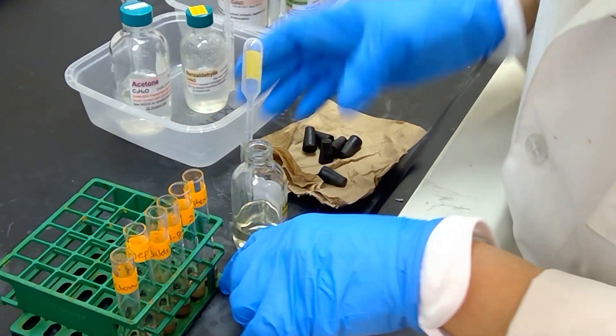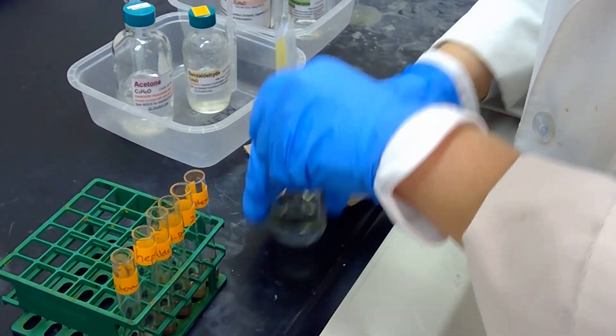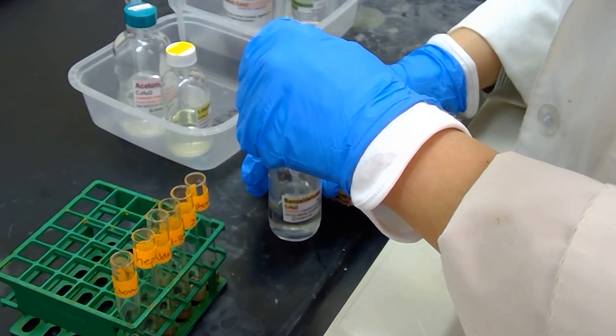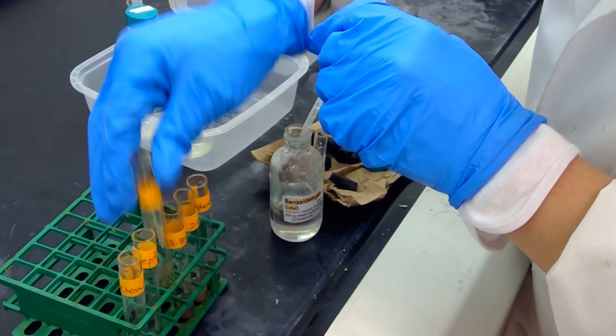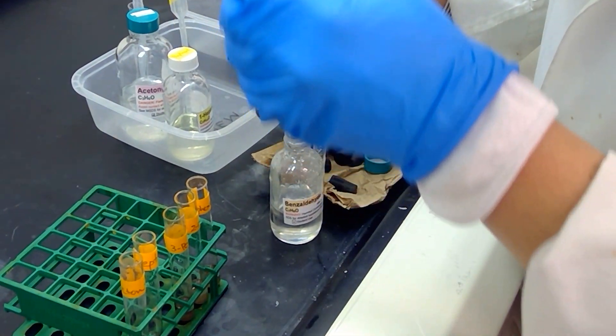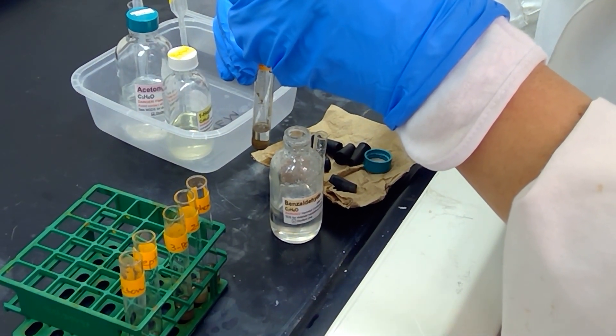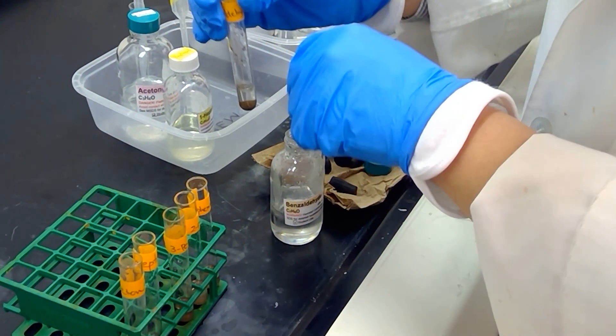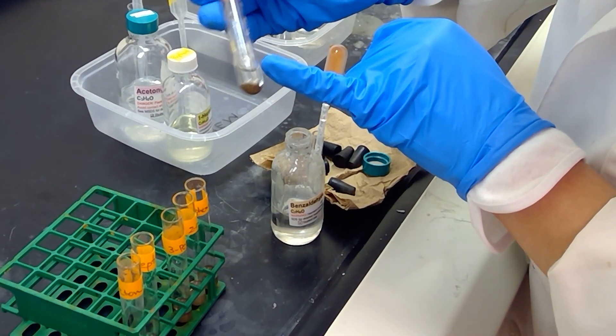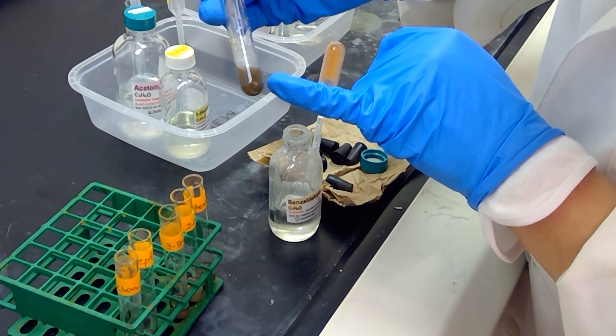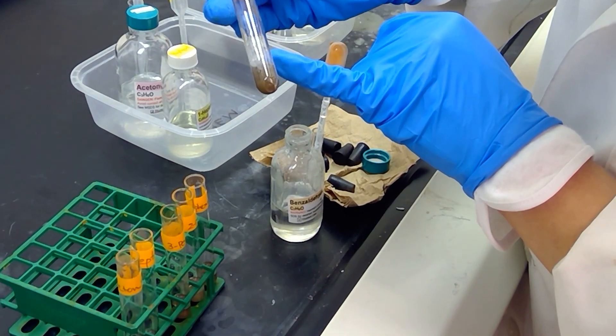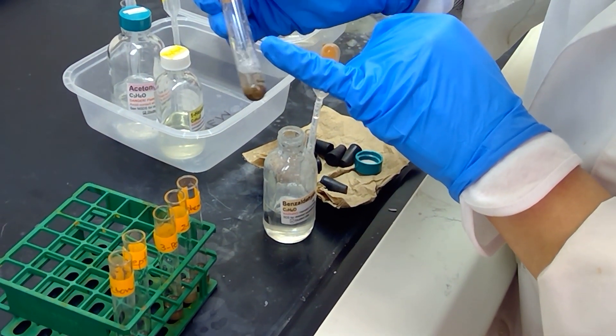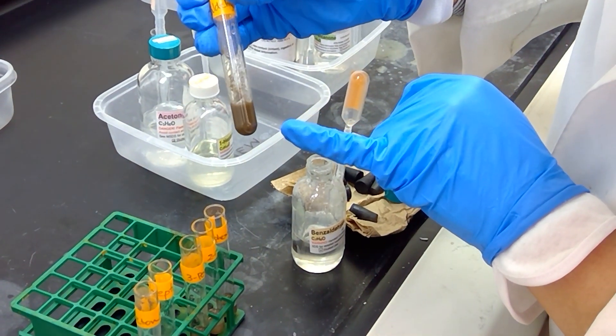I'm going to move on next to benzaldehyde, which is another aldehyde. Let's add a couple drops to our test tube and see if we get some similar situation as we did in heptanal. If you notice here, we are starting to form some precipitate towards the top of the solution, and it is rather shiny and metallic looking.